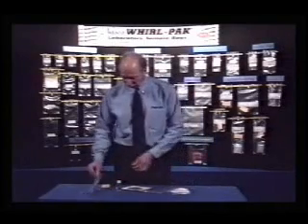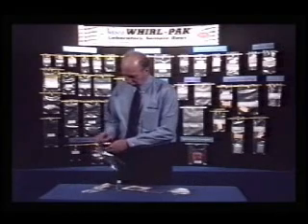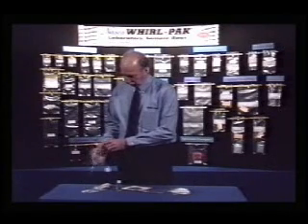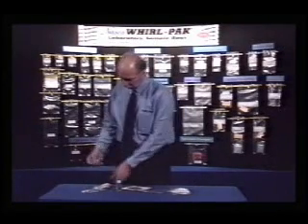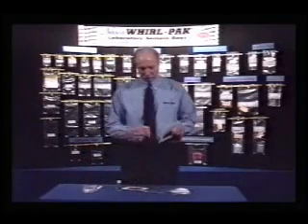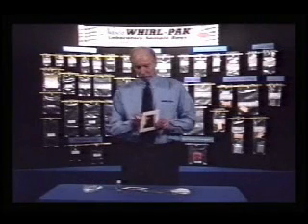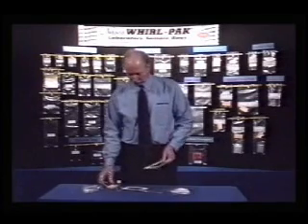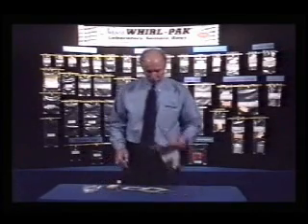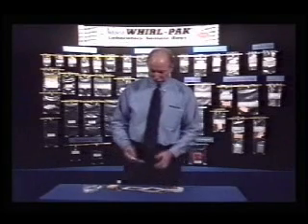There are specific instructions from the USDA explaining how to collect the sample from the carcass, which must be followed by the technician at the slaughter plant. The procedure involves hydrating the sponge with the peptone water. Then, while wearing sterile gloves, the technician wipes the carcass through the template in three locations on the meat carcass and two locations on the turkey. The sponge is returned to the bag and sent to a laboratory for testing.